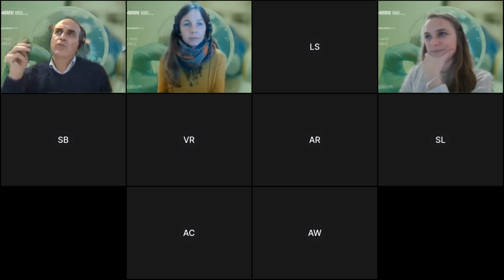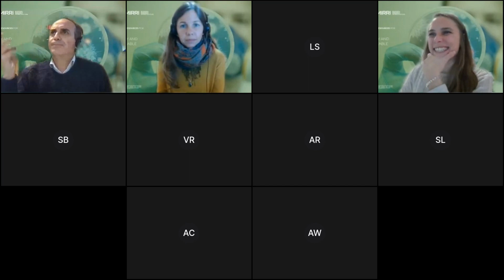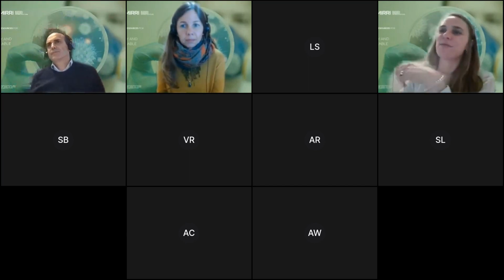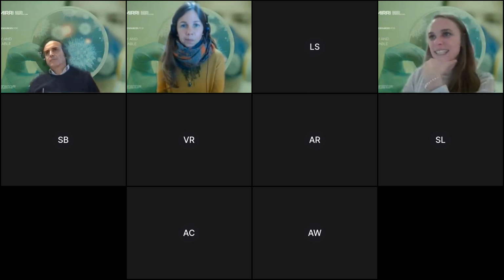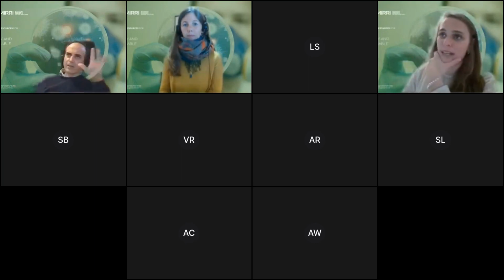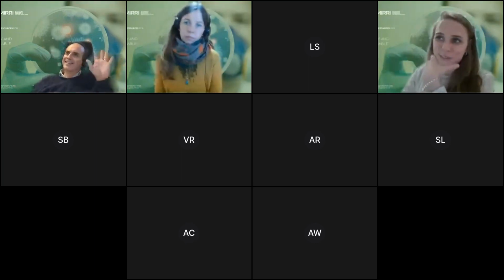Yes, this is one of the challenges of our technique. We can have multiple alleles for a single locus. So usually we keep the consensus. For the bacterial species that we analyze, it's usually not so often.